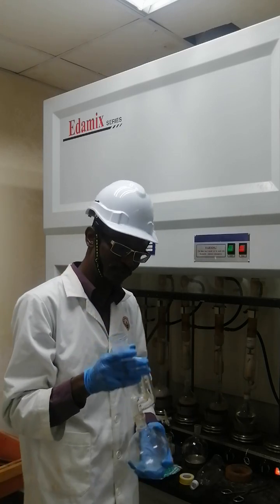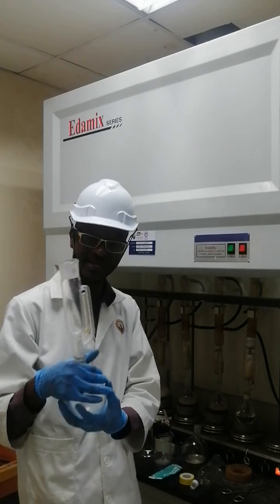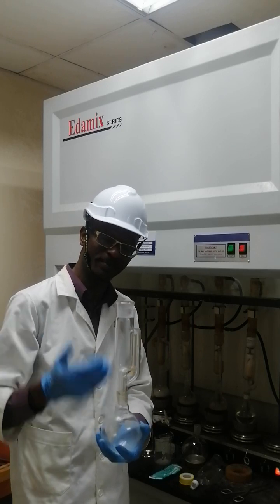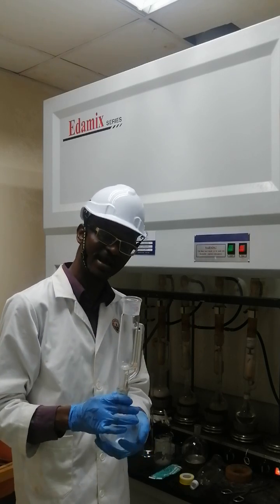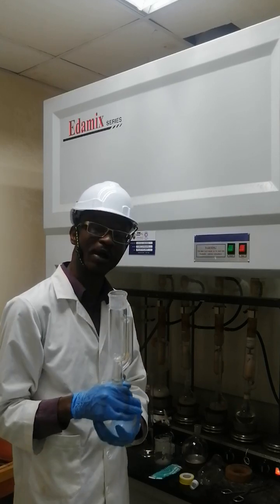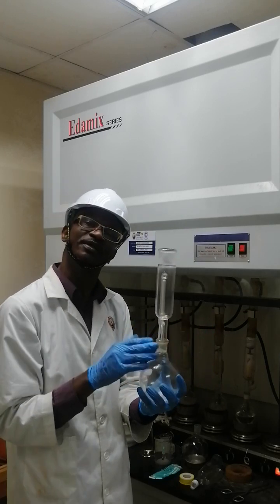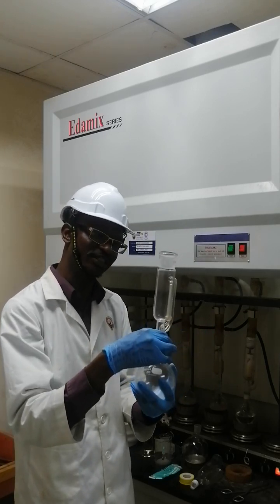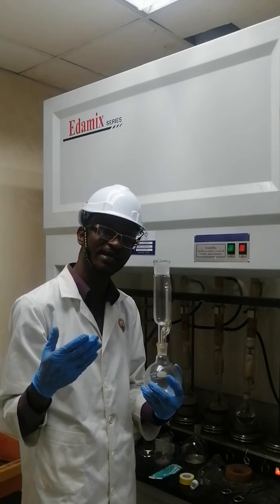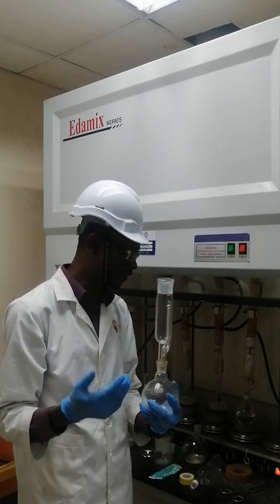Damage is also very expensive. It's costly. Equipment like this, made of heat-resistant glass, is quite expensive. So we will not want damage to our equipment. So when this happens, when the extraction chamber and the grinded joints stick together, what can we do to prevent this from happening from the beginning?